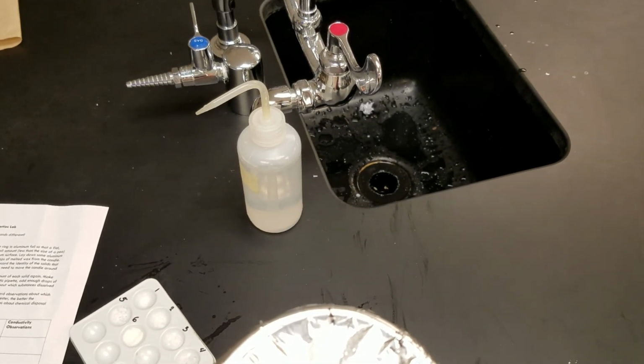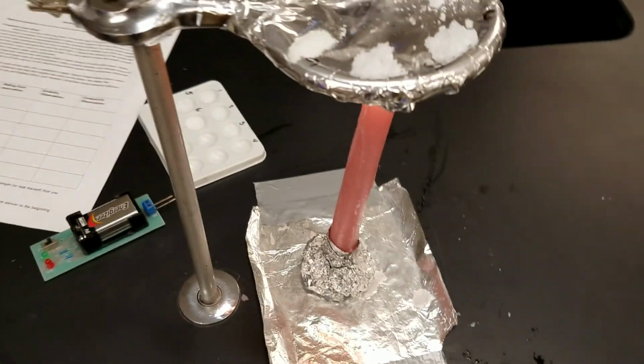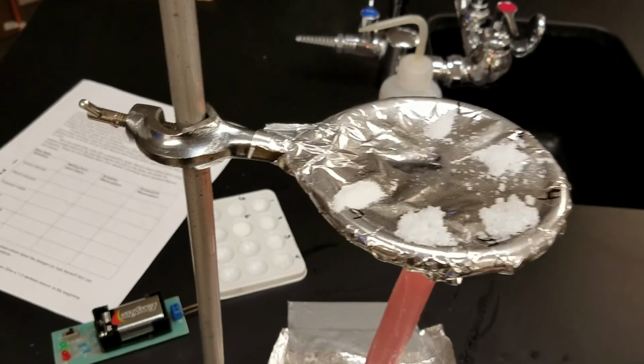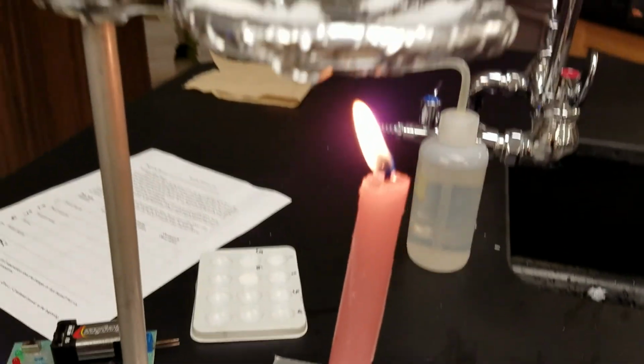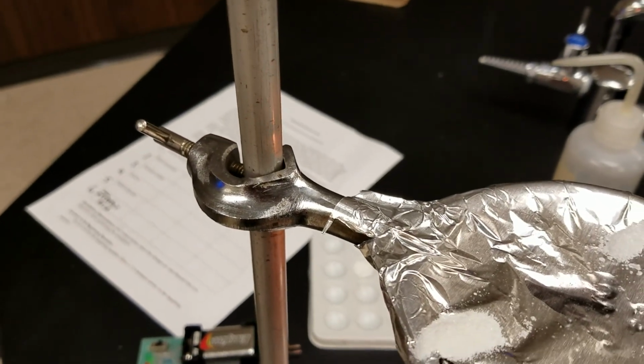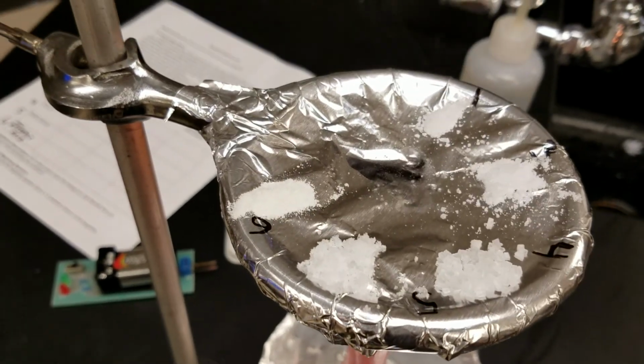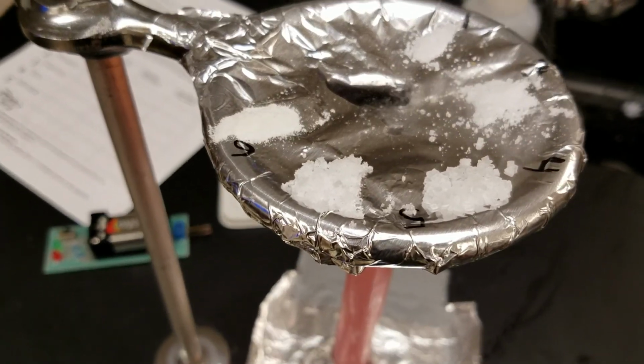I'm going to move this over to just under number 1, which is calcium chloride. Calcium chloride's not doing anything. We'll leave the flame underneath calcium chloride for just a little bit longer, but it's obviously doing nothing.